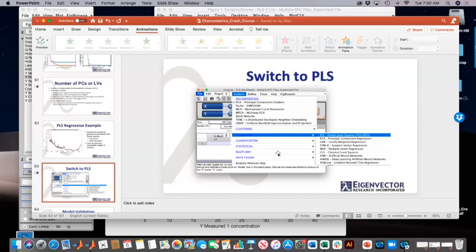There's also, for instance, the possibility that when you change your pre-processing, some samples that were outliers aren't outliers anymore, depending on the pre-processing that you use. For instance, if I use a derivative pre-processing in this, that one sample with the offset doesn't look nearly as bad anymore. So it's a back and forth there, and I can't give you a perfect way through it. That's why this normally takes a while to pick through the options.